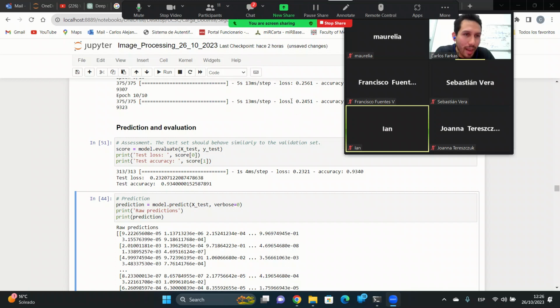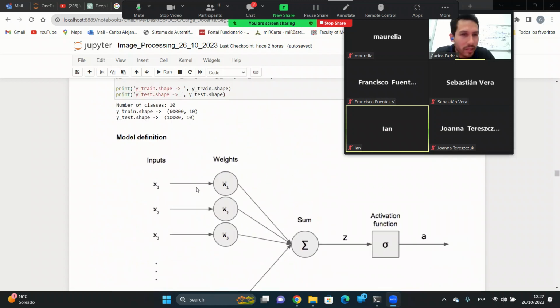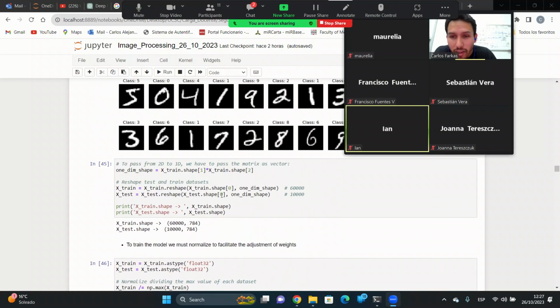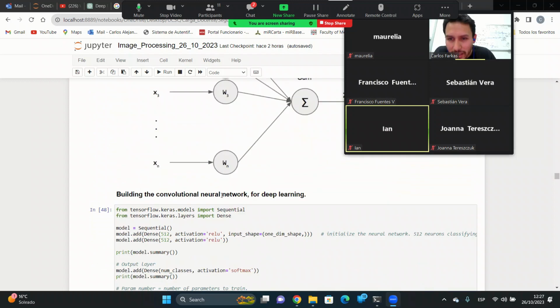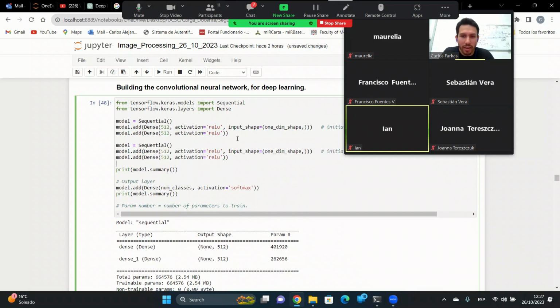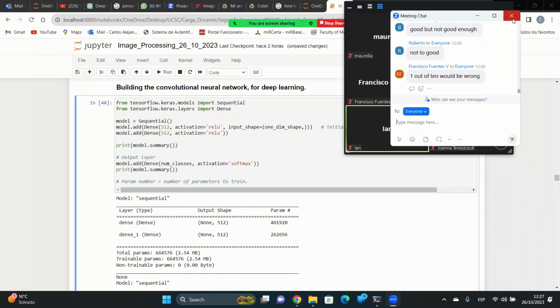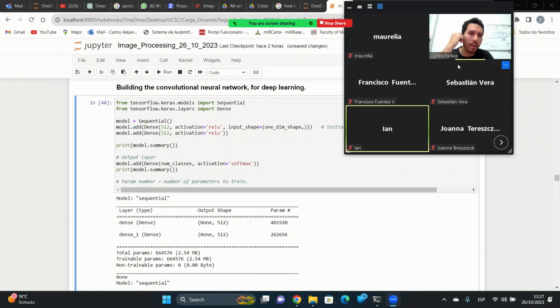Yeah, I did this specific example because it's very nice. Sometimes you get 70%, but what if I tell you, for instance, that you don't need to change this convolutional network so much because this is pretty much established. But what if you need to, for instance, add another layer? You can copy and paste another layer. You can sequentially add more layers. You will increase to 100% accuracy. It will be a perfect algorithm. Right now, 1 out of 10 will be wrong.